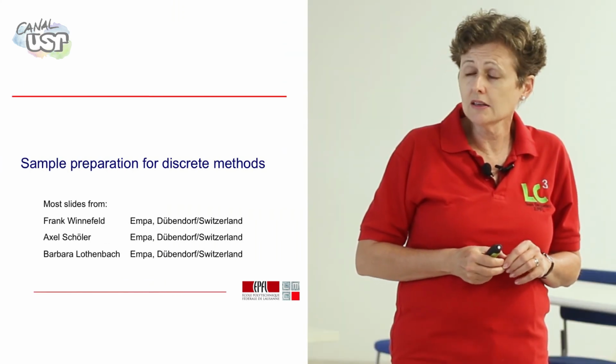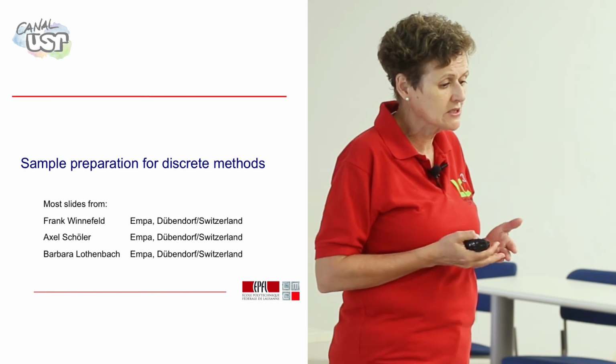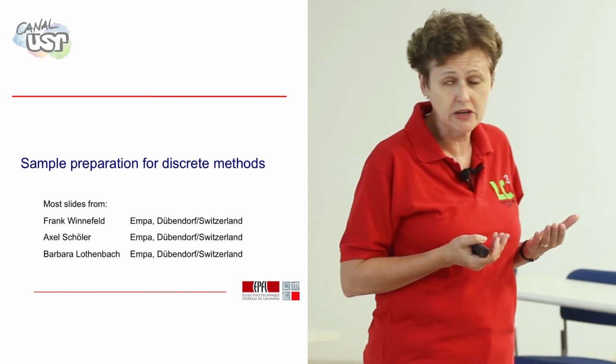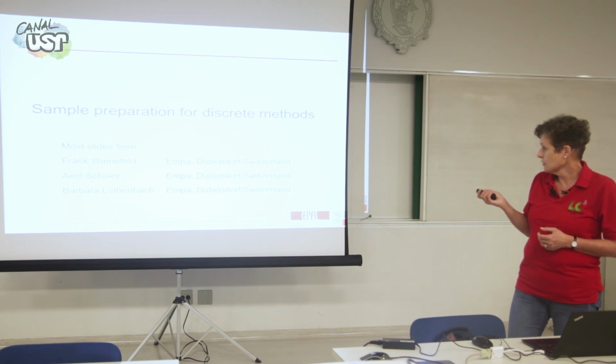So the next slides are now talking about how we prepare samples when we want to do these discrete measurements. And these slides were prepared by my colleagues at EMPA because this course, or most of this course, was presented already in Beijing a couple of years ago. And so I want to acknowledge that these were the people who did these slides.